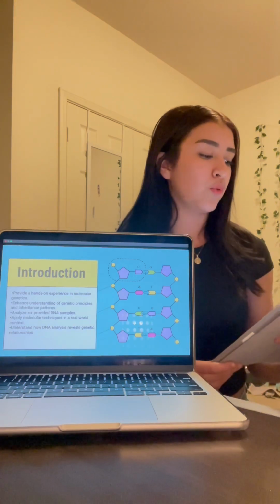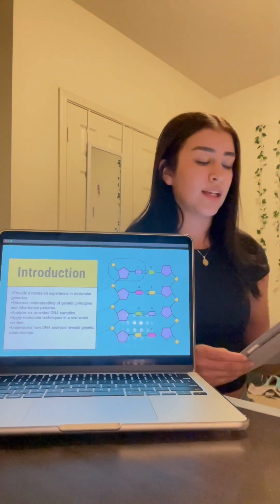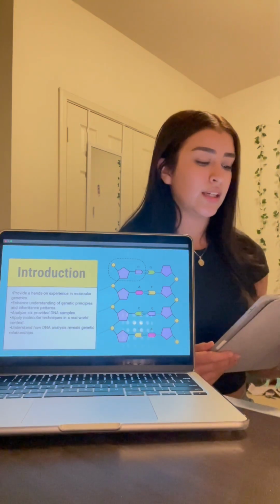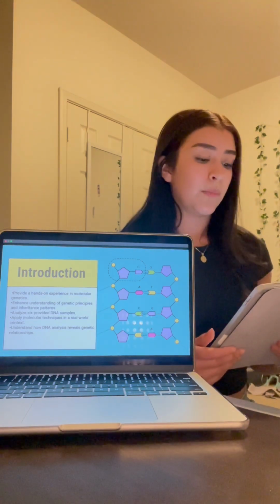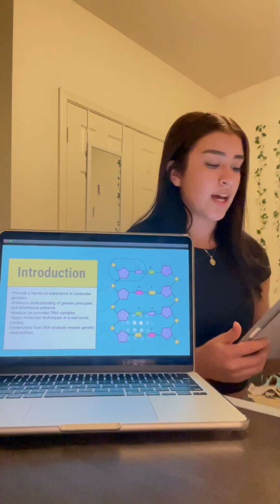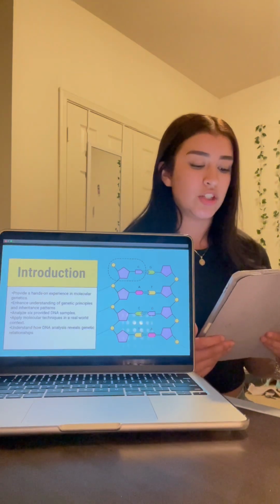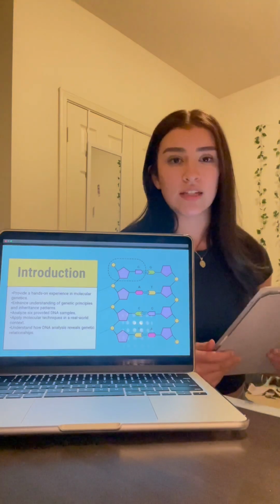This exercise will not only reinforce key concepts such as DNA profiling, inheritance patterns, and genetic markers, but also introduce students to essential laboratory techniques like gel electrophoresis. By the end of the experiment, students will have gained valuable insights into how genetic testing is used in fields such as forensic science, medicine, and genealogy, preparing them for more advanced studies in genetics.